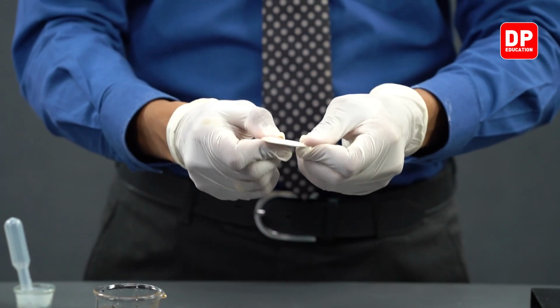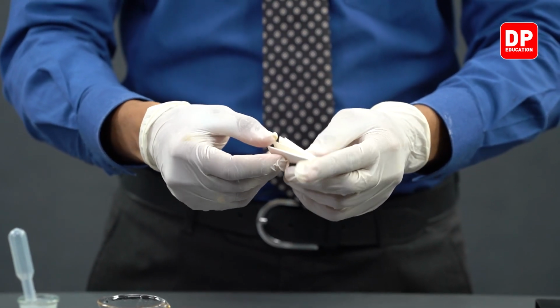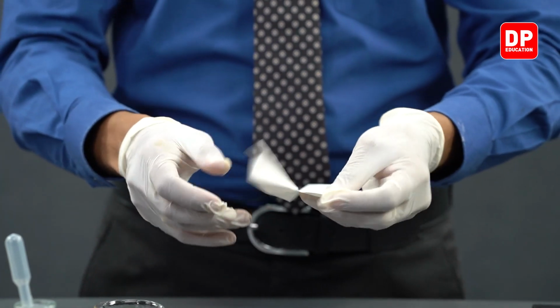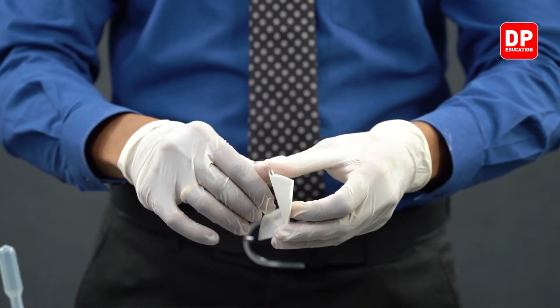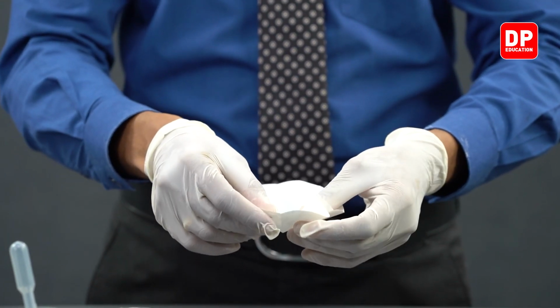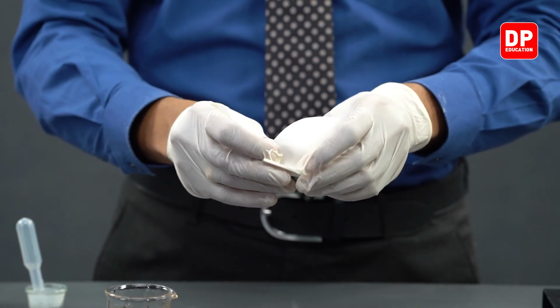Now, after you have folded it like this, you will be unfolding it, and you will arrange it in a manner like this.